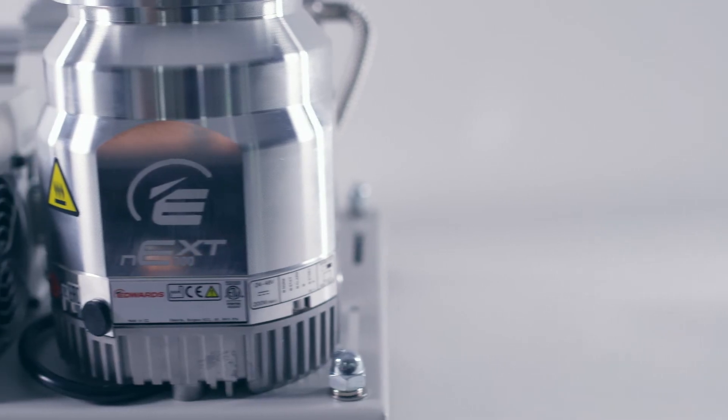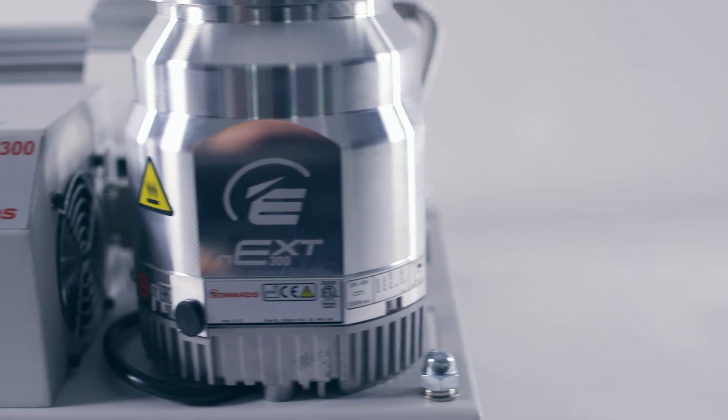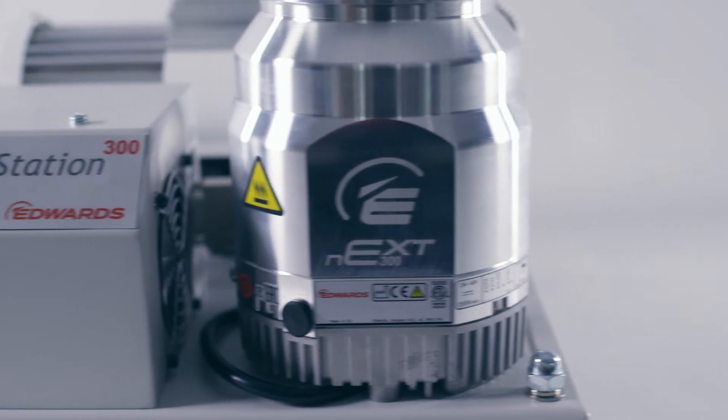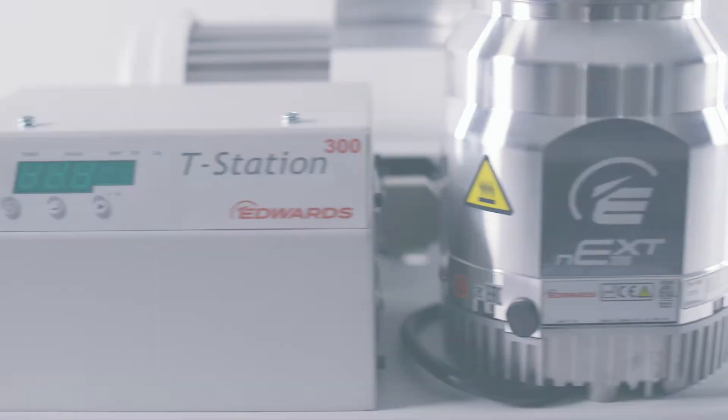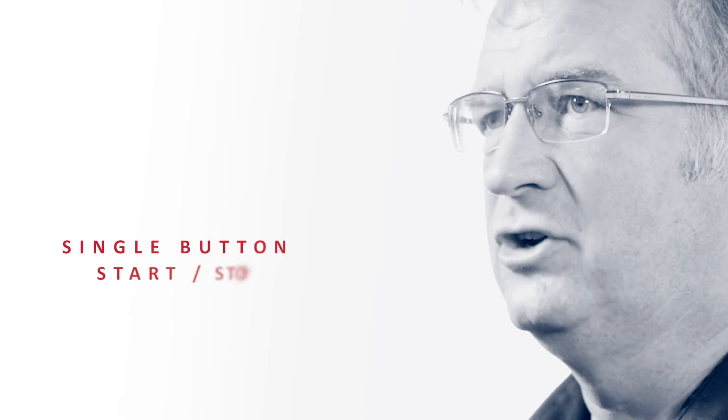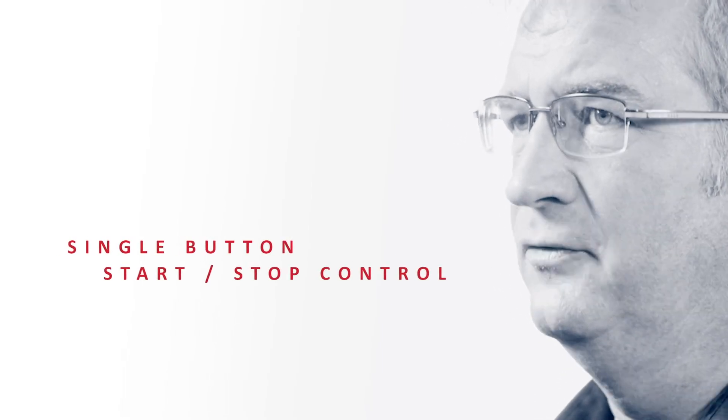The T-Station is supplied with an integrated turbo and active gauge controller. This enables single button start-stop control of the system and has an easy to read display.